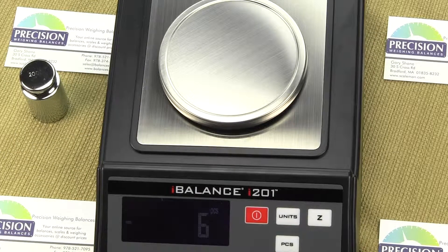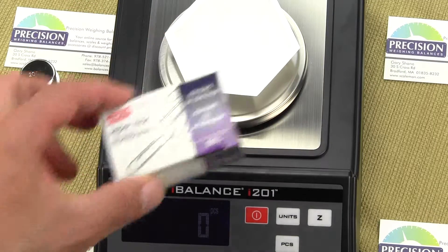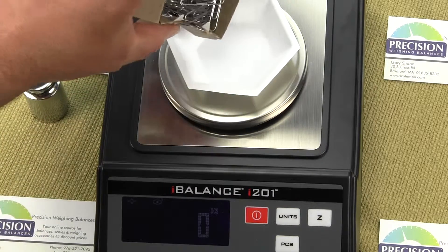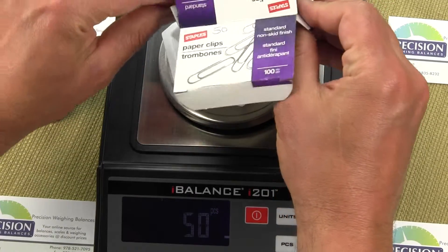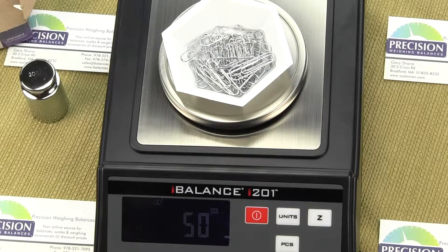Now I remove those paper clips, put my container back on, and I pre-counted 50 paper clips in this box. We'll see if the parts counting feature records 50 paper clips. And there you go — the box is empty and we have 50 paper clips counted. The parts counting feature is very easy to use, and you can count all kinds of parts.